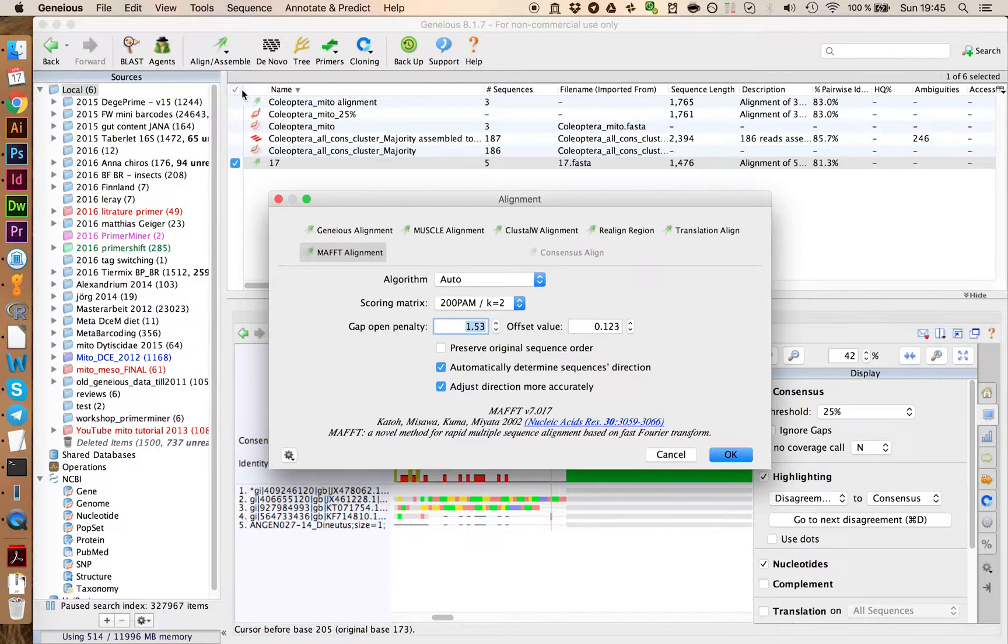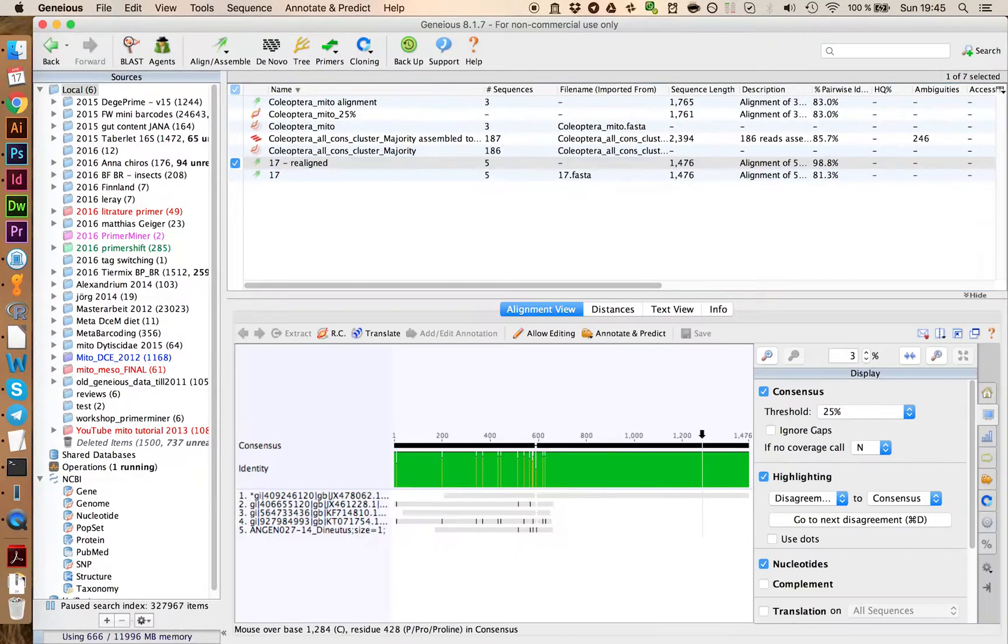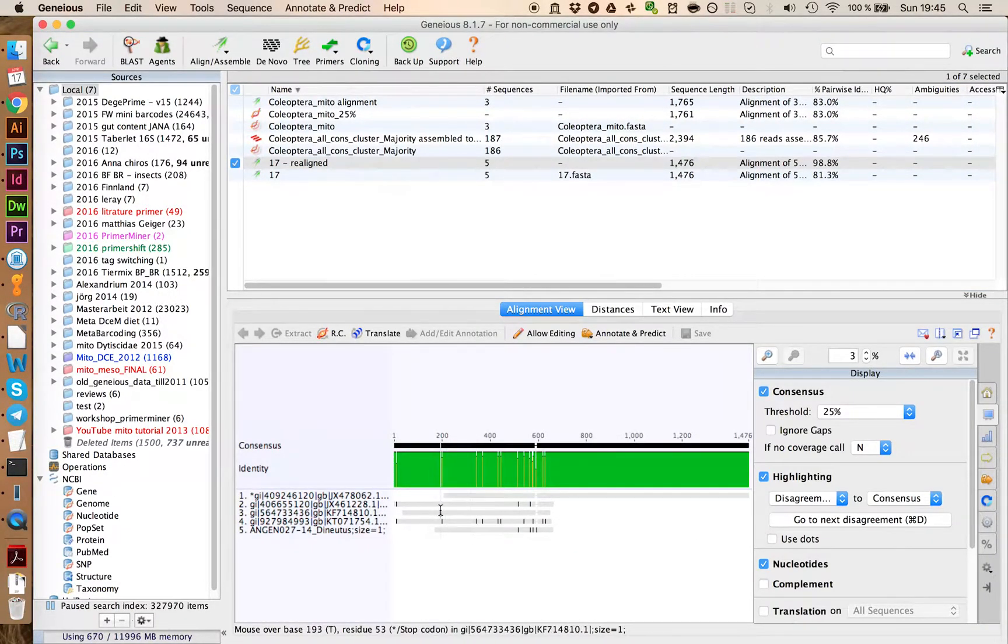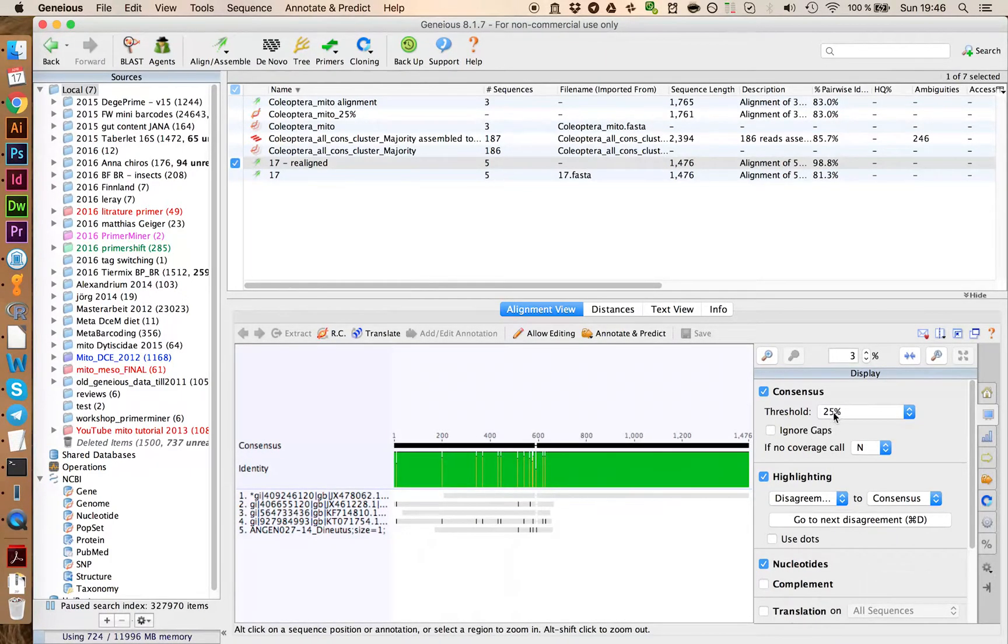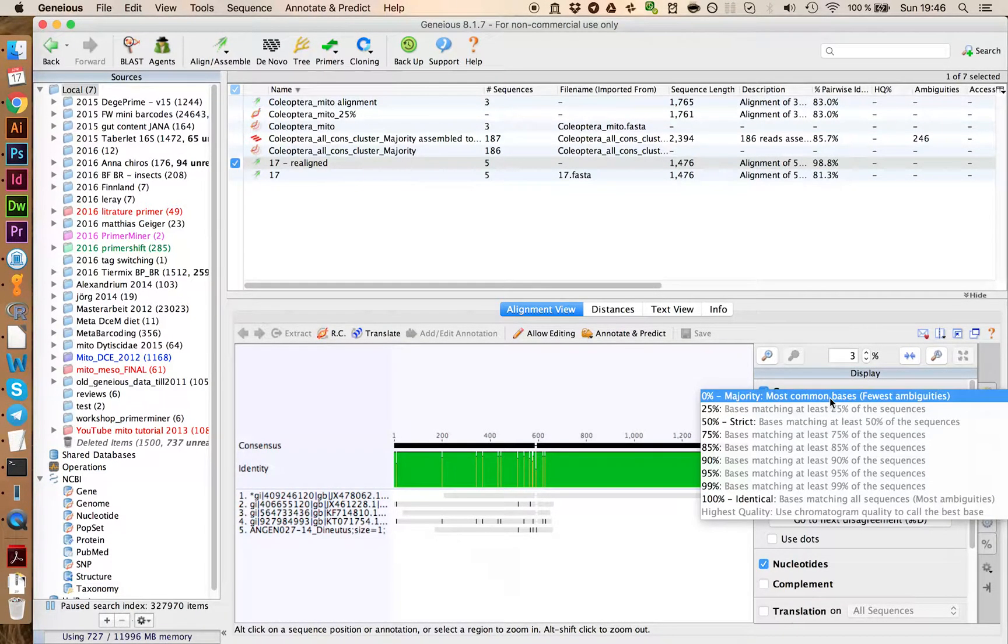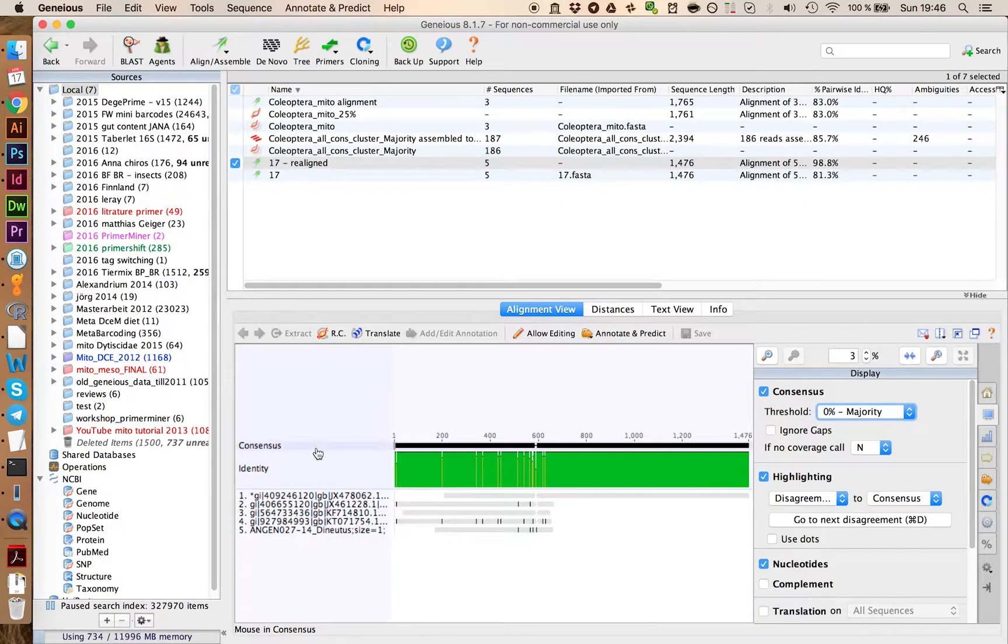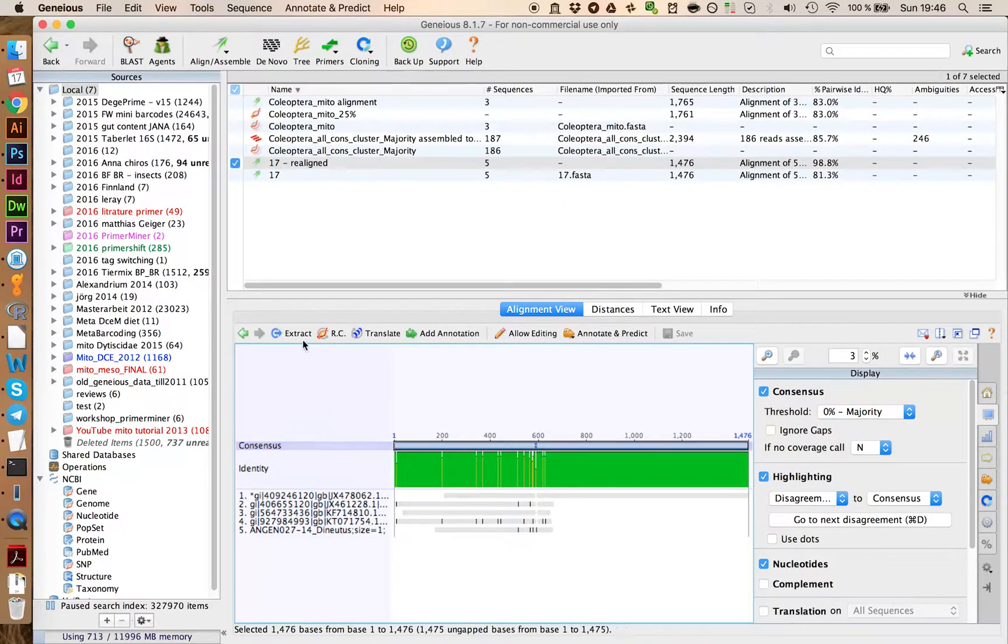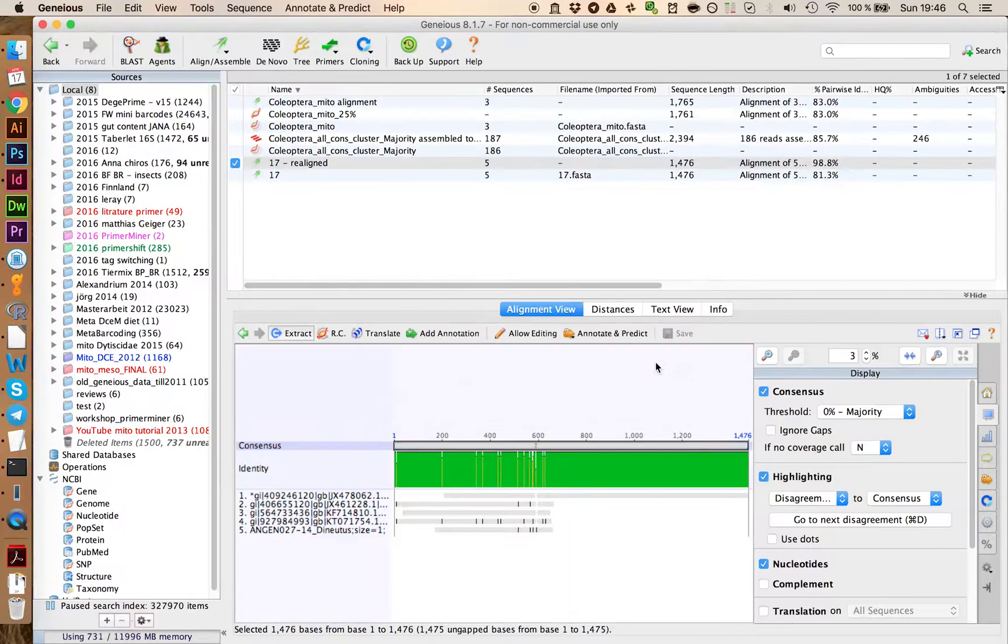We're just going to make a new alignment of this data. And we see that if you align it again, it's now making a lot more sense. We can take this consensus sequence. You want to switch it to majority. And we're going to extract this consensus.